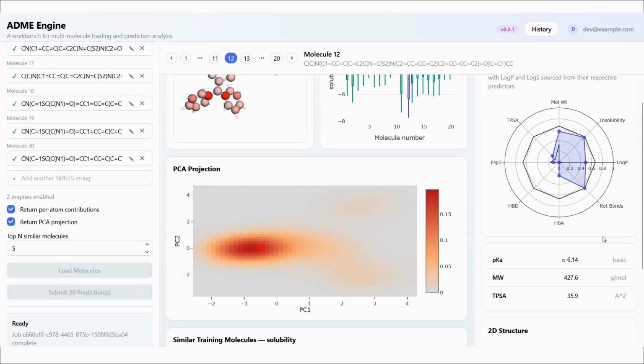We have a vision of the Navexis platform driven by laboratory feedback and including features such as agentic design workflows to be able to significantly save effort during the design and synthesis of new compounds.